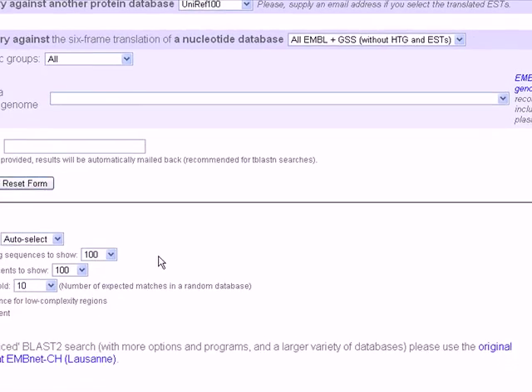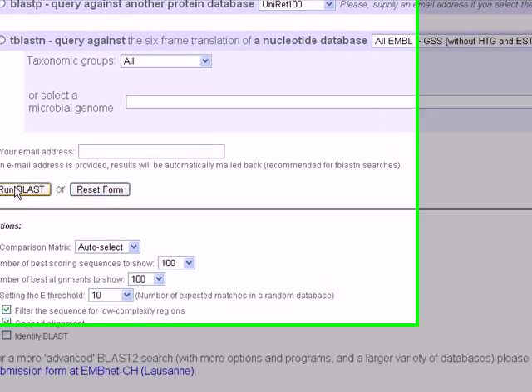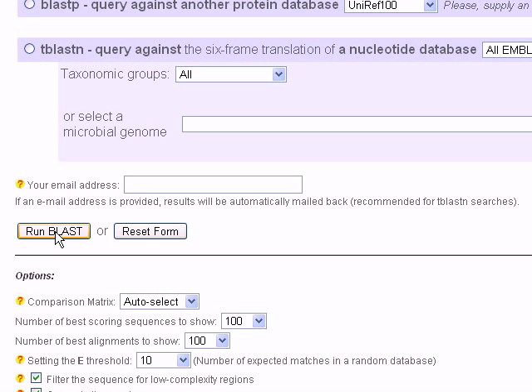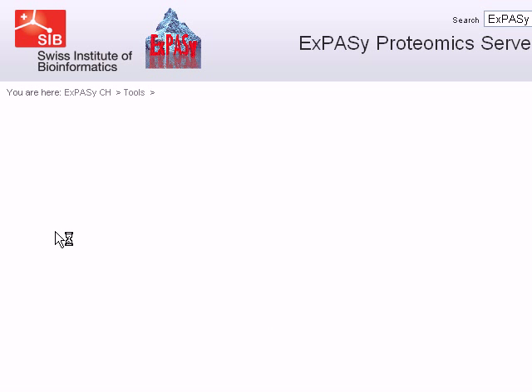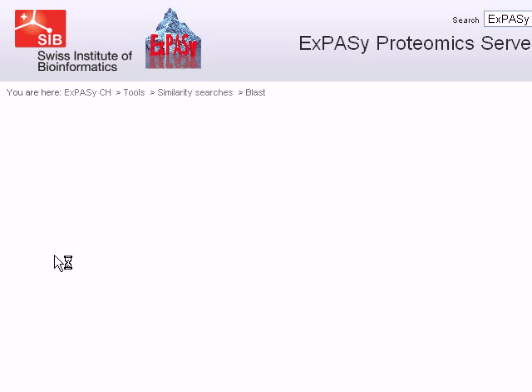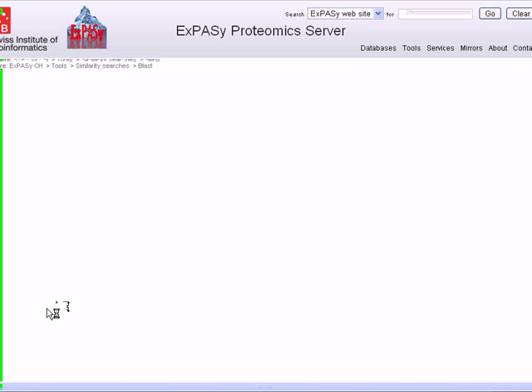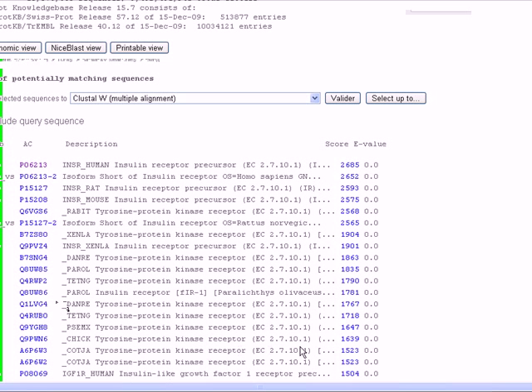To run the basic BLAST search, we click on the Run BLAST button, and you wait for the result page to appear. It's going to take a little time, so we have to wait until the result page appears.